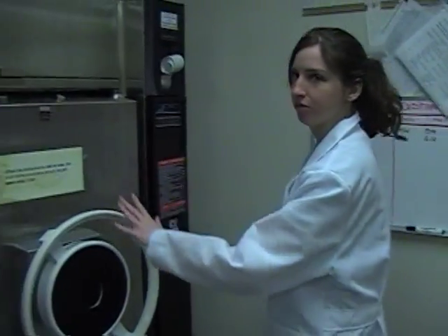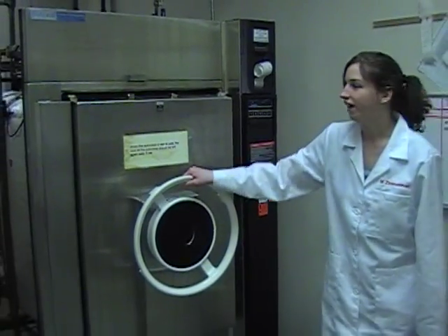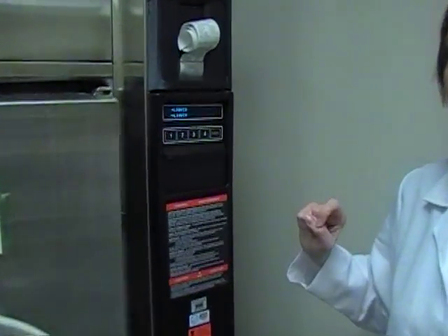Hi, I'm Margaret Zimmerman and in this tutorial I'll show you how to load the autoclave with a variety of items. First off, this is our autoclave machine. This is the door handle and here is your control panel to activate the autoclave.